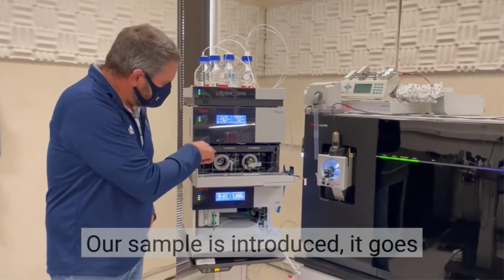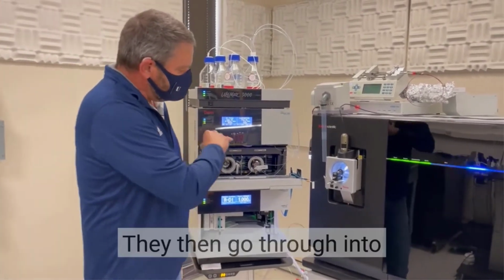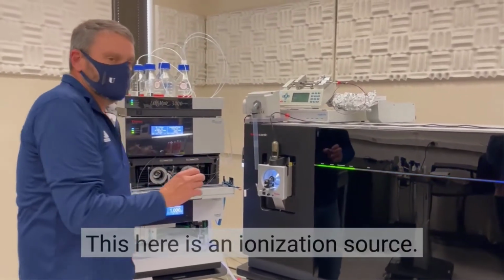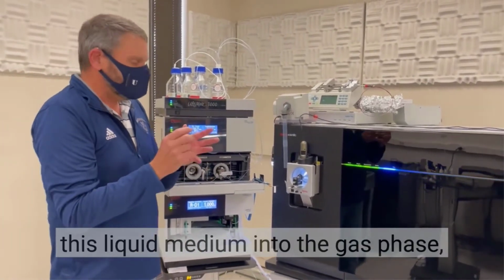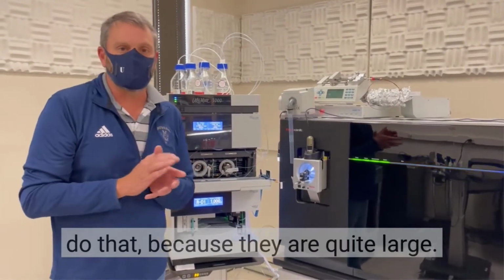Our sample is introduced, goes through this column and separates, because samples tend to be very complex. They then go into the mass spectrometer. This here is an ionization source, so we're going from a liquid to a gas phase. Our molecules have to go from this liquid medium into the gas phase, and it's hard for a protein to do that because it's quite large.